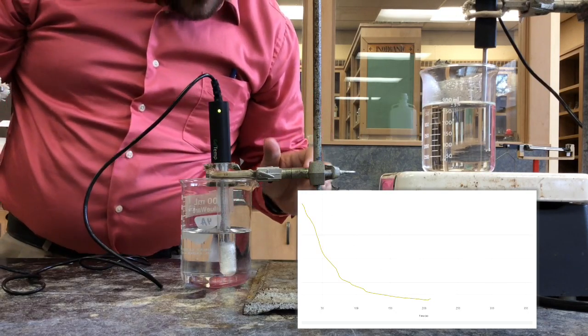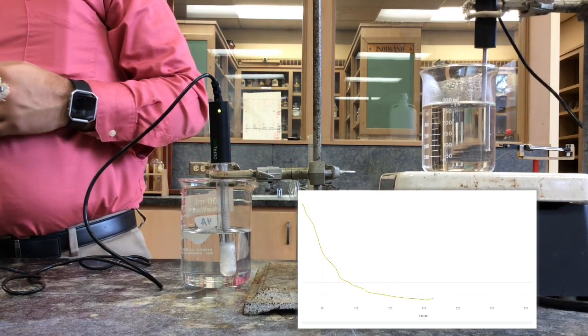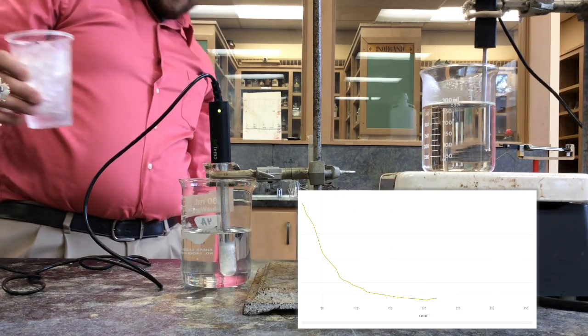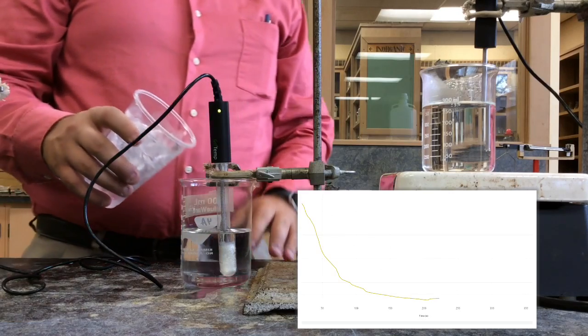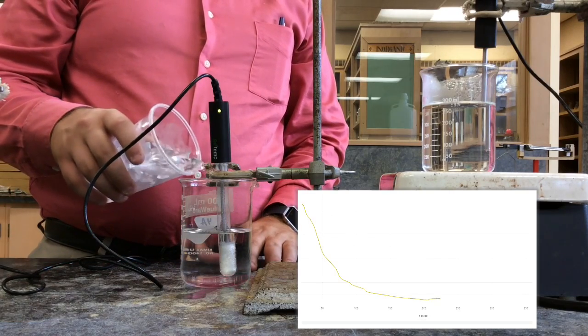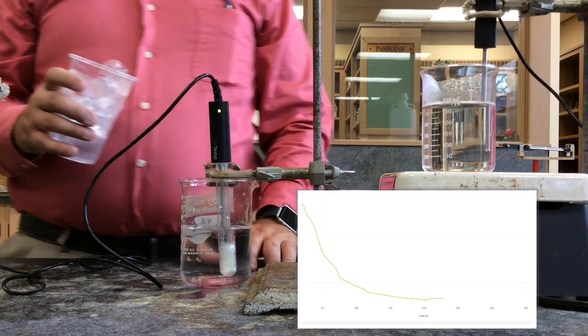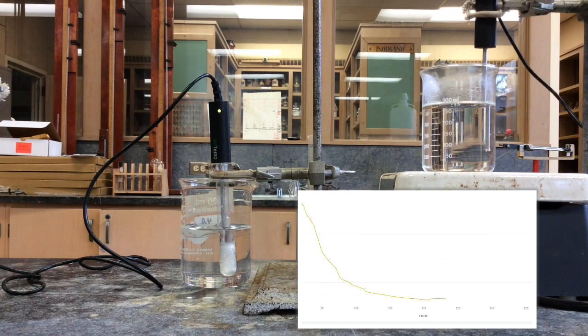So I can let go of it now and it's completely staying in place because it's pretty much solidified. So what I want to do at this point is make this even colder. Let's see what happens when I make it even colder. And so I'm going to just add a couple ice cubes to it. And I'll annotate on the graph where I added the ice cubes.